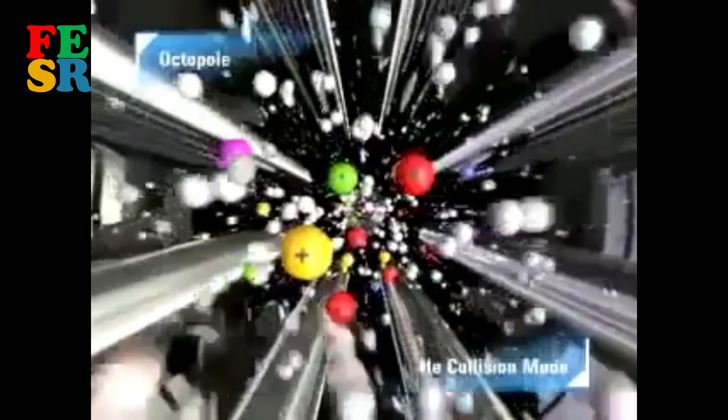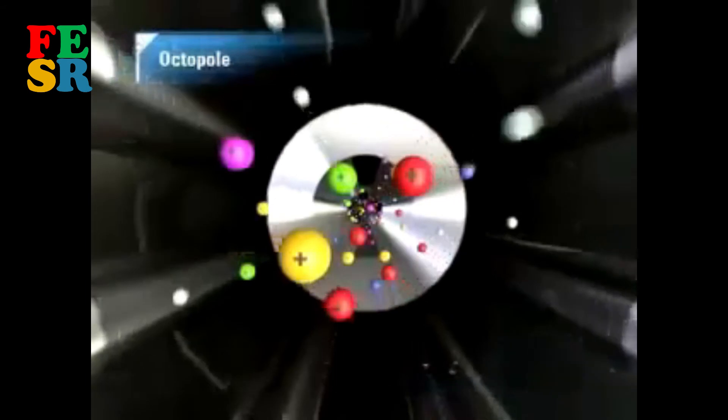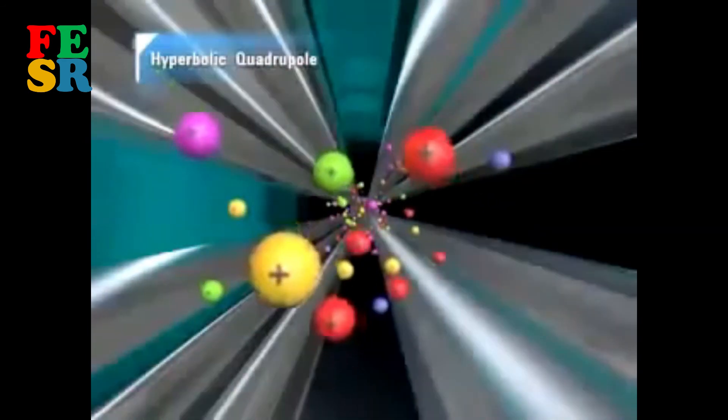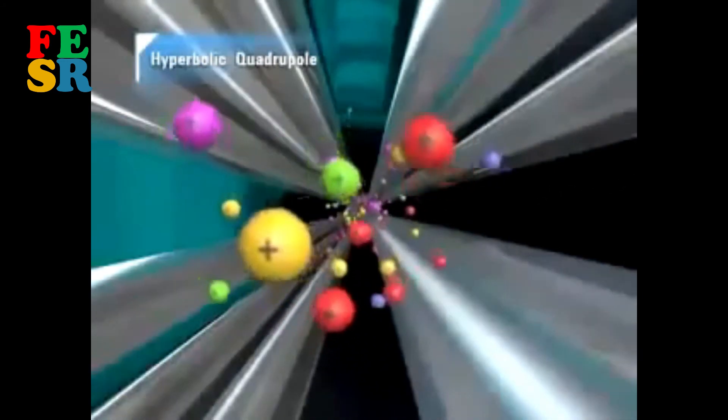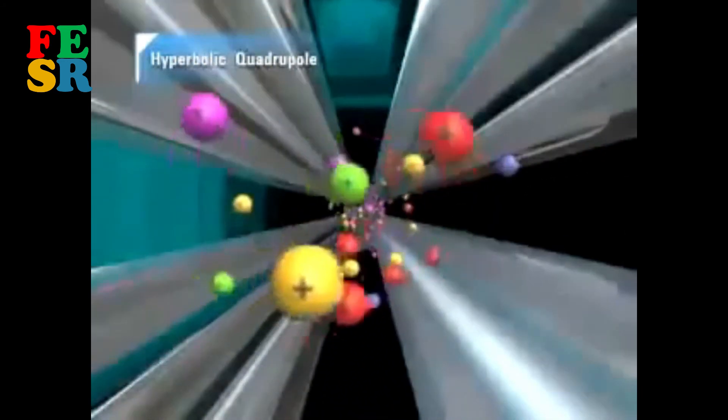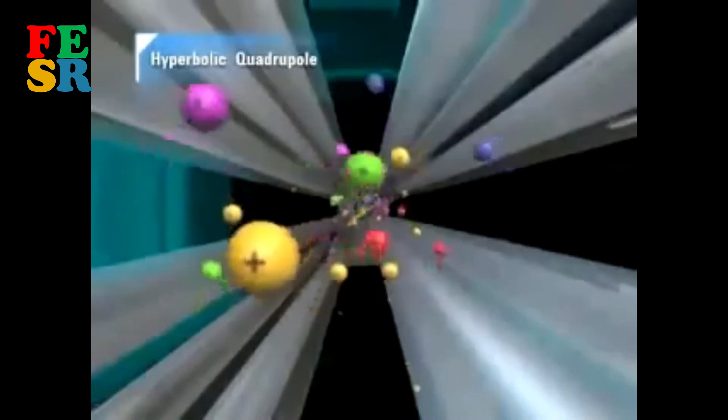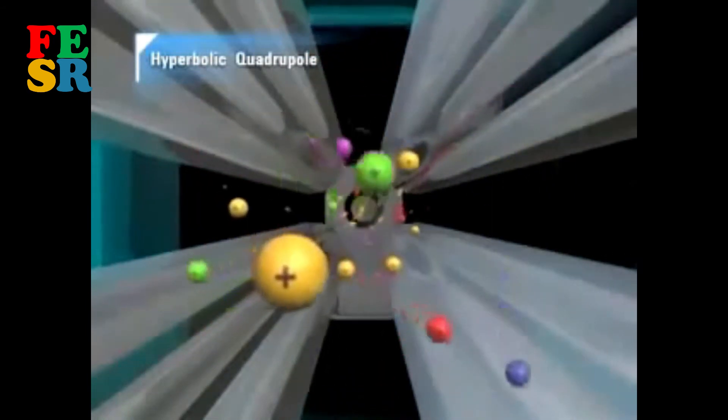The low-energy polyatomic ions are prevented from leaving the cell by energy discrimination. The analyte ions leaving the ORS cell enter the quadrupole mass filter and are separated based on their mass-to-charge ratio. Only the target ion is stable and passes along the axis of the quadrupole. The quadrupole scans rapidly across the mass range and passes each mass of interest sequentially to the electron multiplier detector.